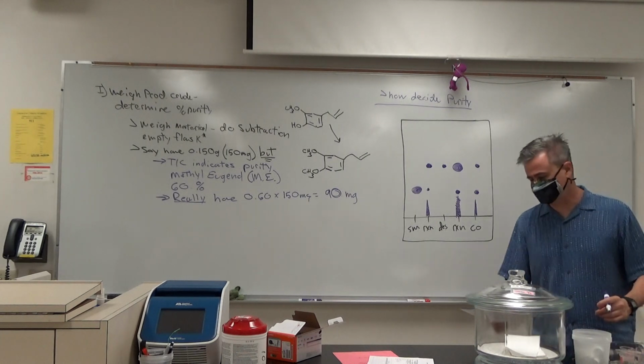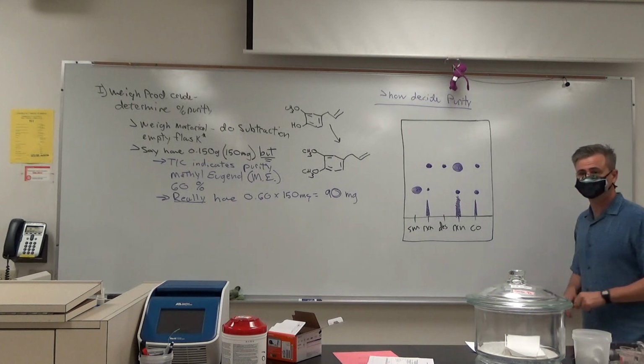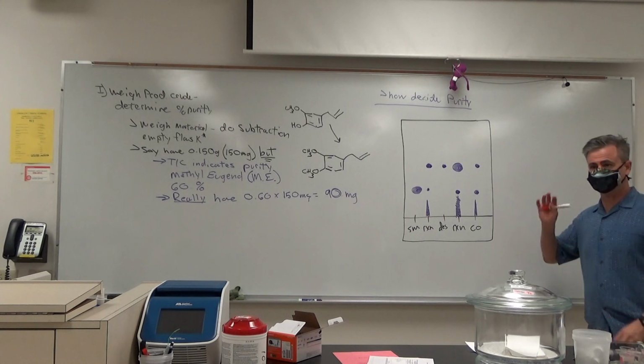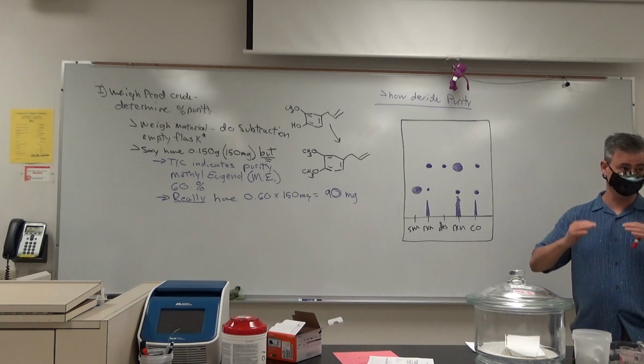Do we have evidence from this TLC that we made product? Yes. I'll tell you right now, we have no proof. You're not going to get proof on TLC. The only thing TLC can ever prove is that two things are different.